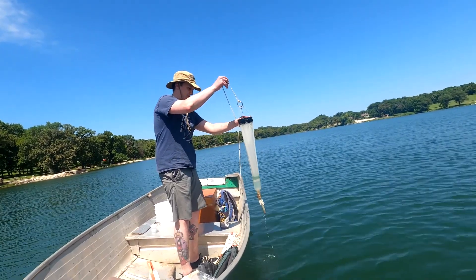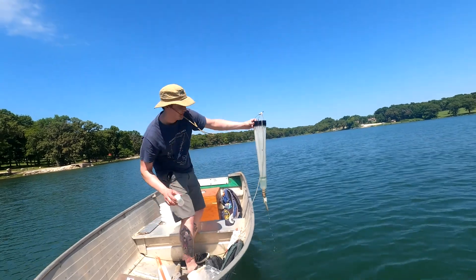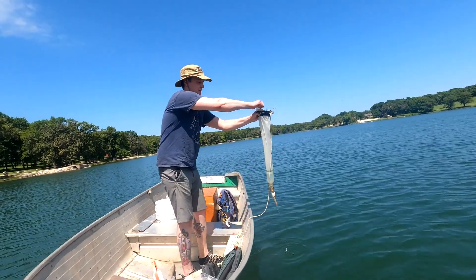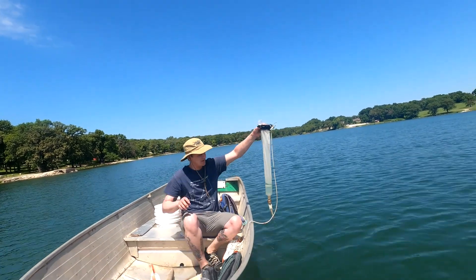Then we'll pull it up and I've got a container here ready that's labeled, and we're just going to evacuate the contents of that bottle into the container.